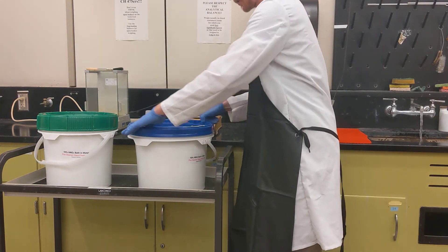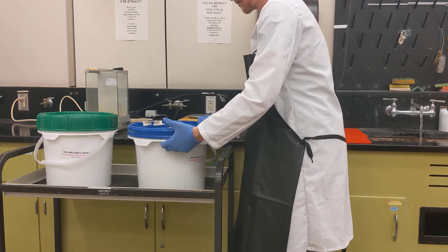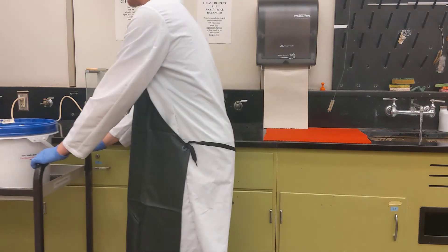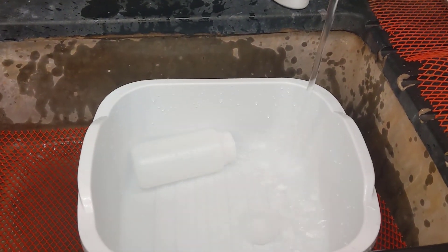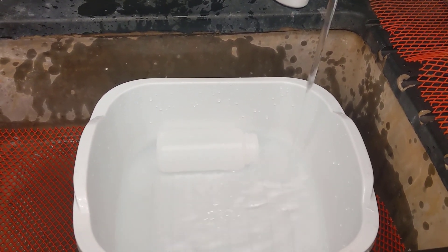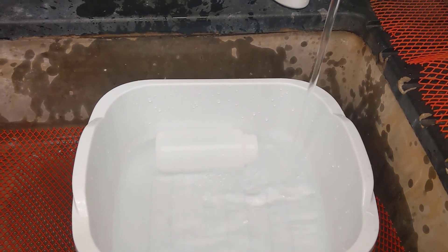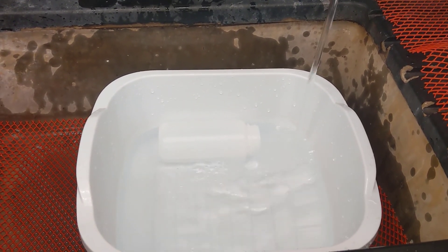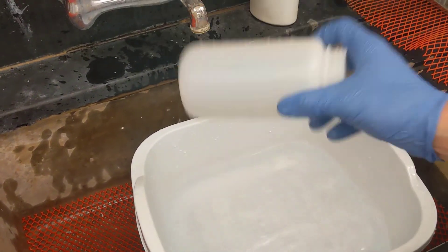Go ahead and re-secure the lid — make sure it's tight against the grommet to prevent evaporation — then wheel the acid baths back into the corner. Now fill the vat with deionized water, triple rinse all of the vessels, and leave them to air dry. Then put your acid bath tote back under the bottom of the rack when you are finished.